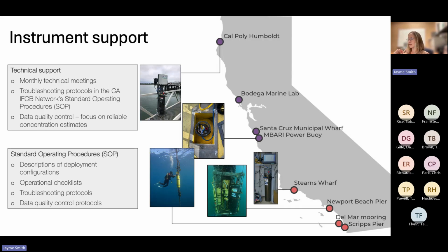We have a standard operating procedure where we've done experiments to try to normalize how we're counting and have the lasers set in the same way. So you're counting at the same thresholds, for example. And then there's the network.